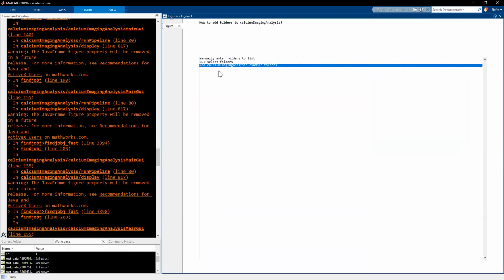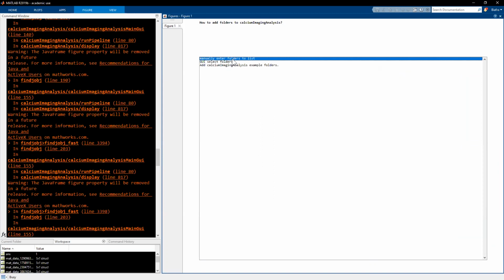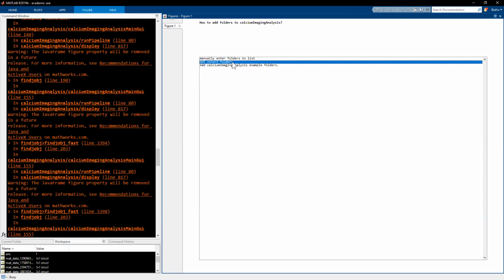So you can do this in several ways. One is if you just have a list of folders. So I tend to have more or less a list of folders that are either created automatically, or, if you're on Windows, you can use programs like Everything that allow you to really quickly get a list of all your folders. The other is you can do it via GUI.